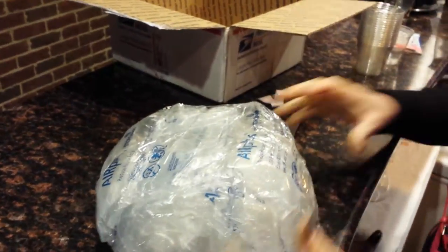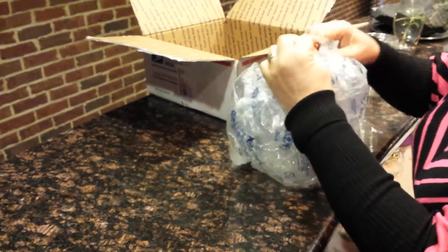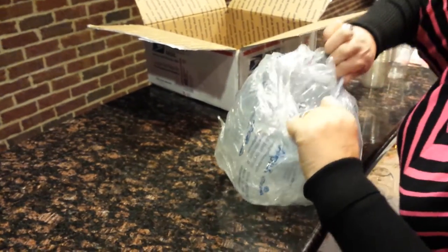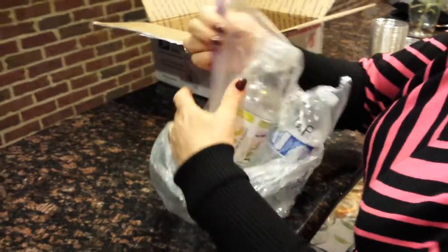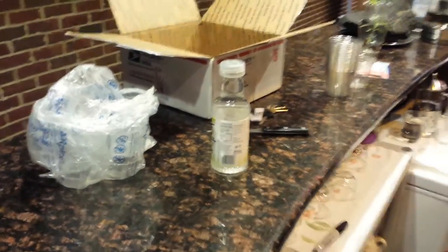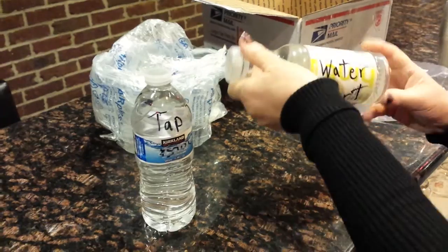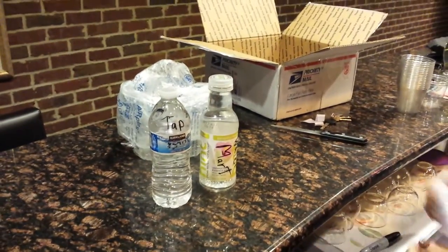This guy knows how to pack! All right, what do we have? It fell — it's okay. Look at this: we have his tap water, and that's the water he buys from the water mart. All right, let's do our thing here.